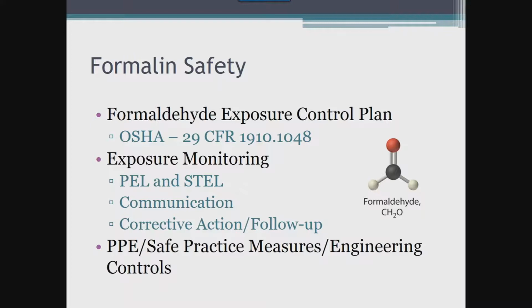OSHA defines a time-weighted average from the standpoint of an 8-hour period and then as an action level within that 8-hour period. So the limits that are defined are 0.75 parts per million within an 8-hour period. And at any point in time during that 8-hour period, the exposure should not be any greater than 0.5 parts per million. This latter measurement is called the action level.